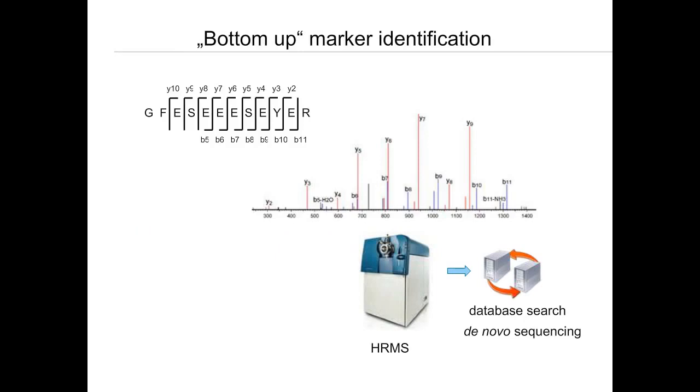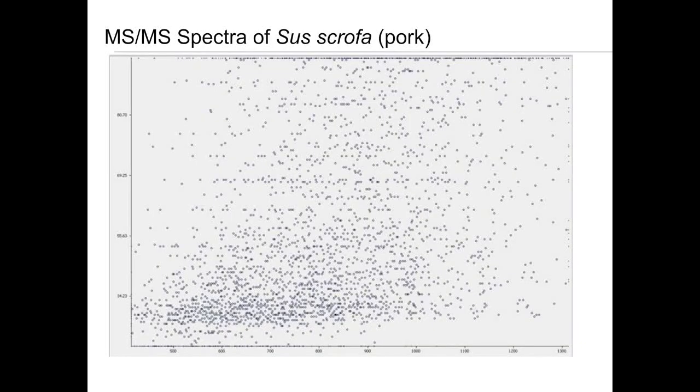First of all, I'd like to give you a brief example of how these mass spectra can look. This is one example of a given peptide here on the left side, and you see that we have a nearly complete set of B and Y ions of this peptide, and here's the mass spectrum. The B and Y ions are annotated, so we have nearly complete two-fold sequence coverage of this peptide, and with high statistical confidence we can identify these peptides. And this is done in a highly parallelized fashion, as indicated on this slide.